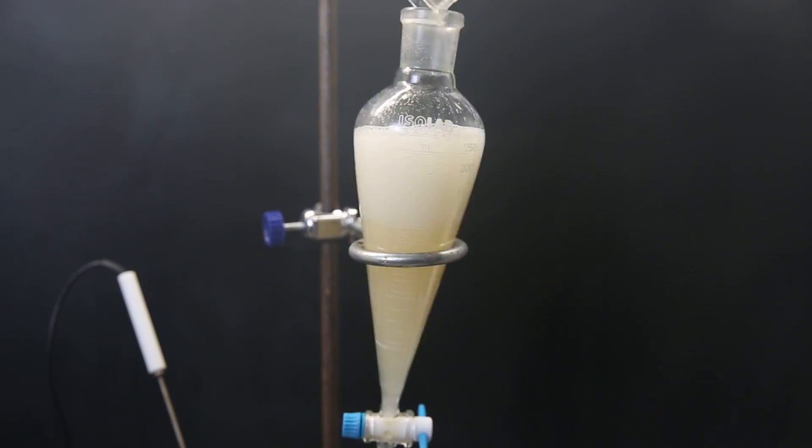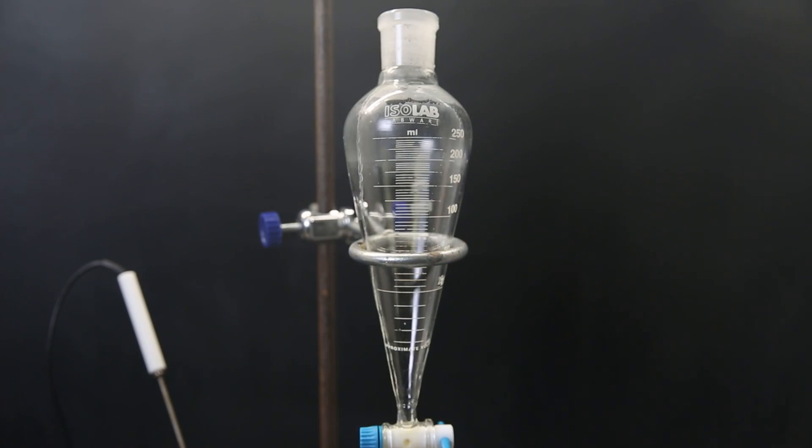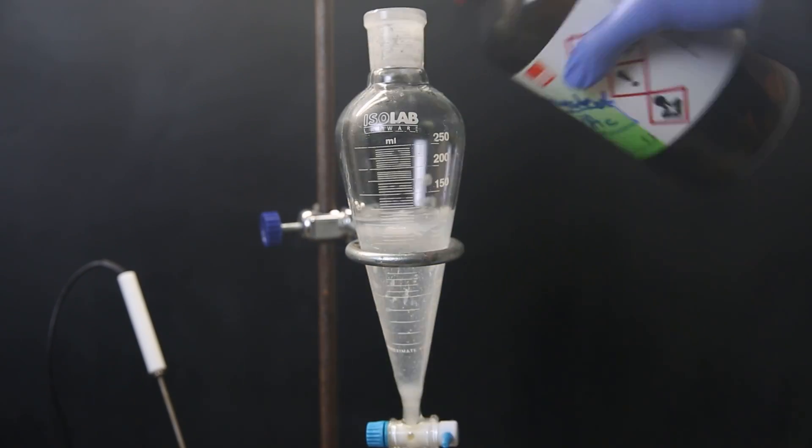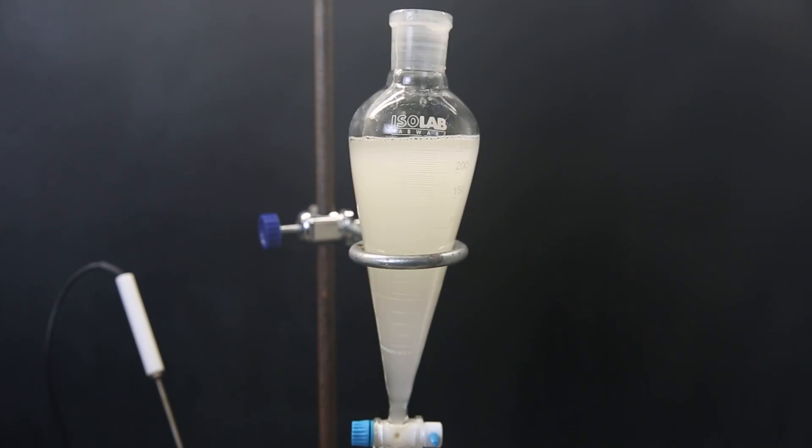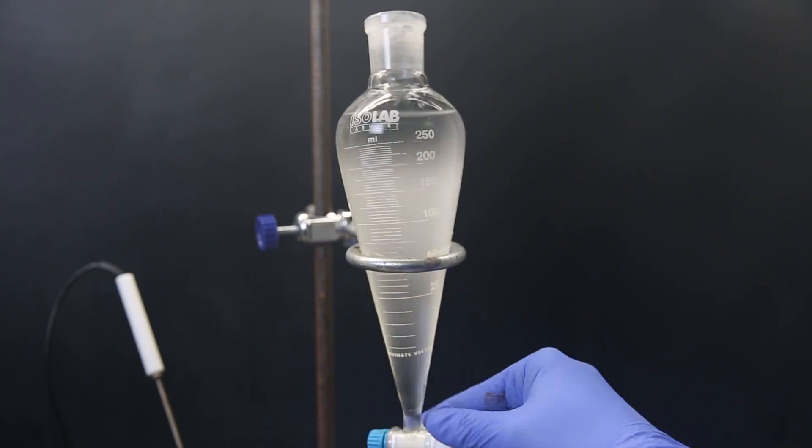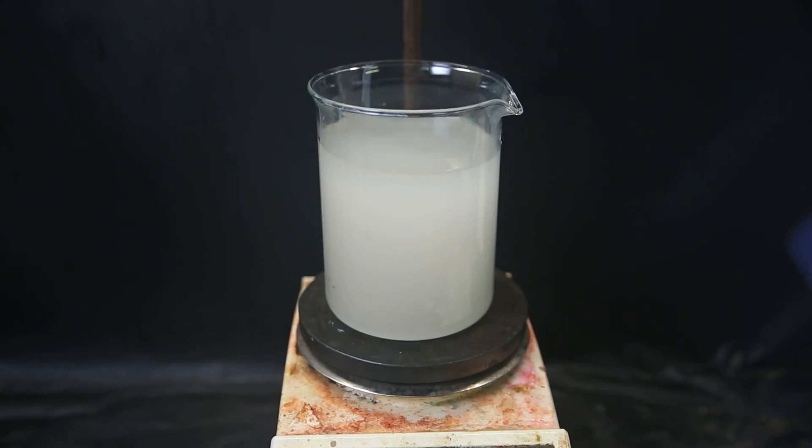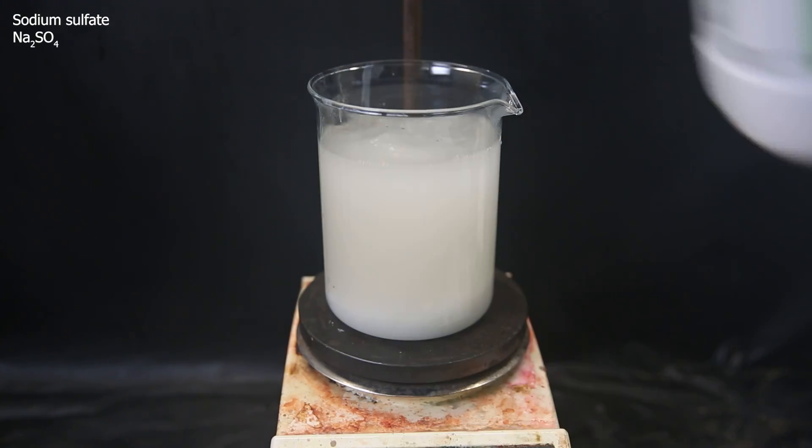I then separate the layers and extract the water layer several times with ethyl acetate instead of dichloromethane, since it seems to have better solubility. The combined dichloromethane and ethyl acetate extracts are a cloudy mixture. To remove remaining droplets of water, I add some anhydrous sodium sulfate, which will absorb them.